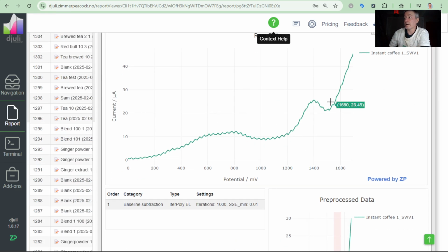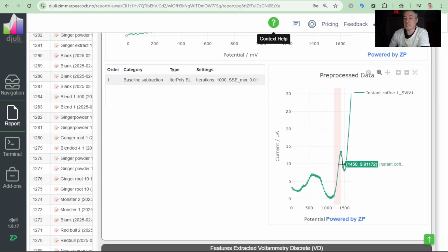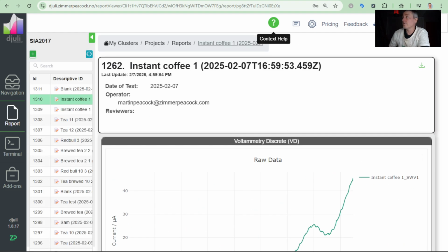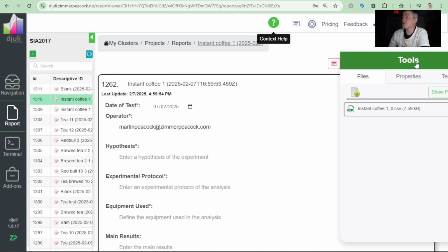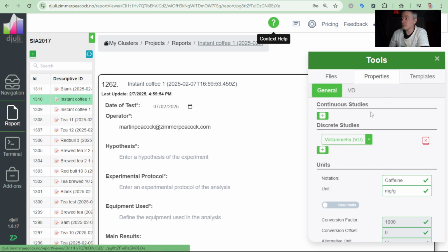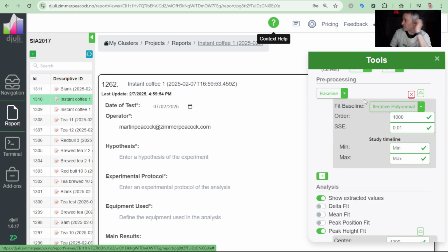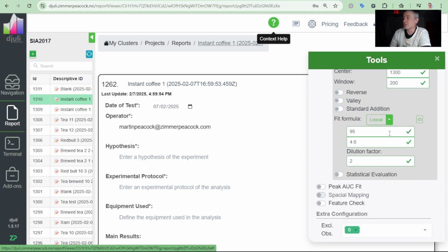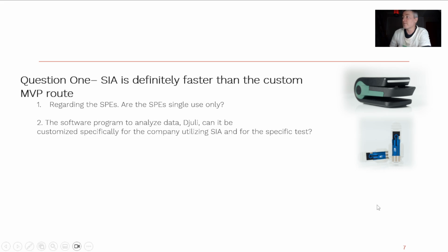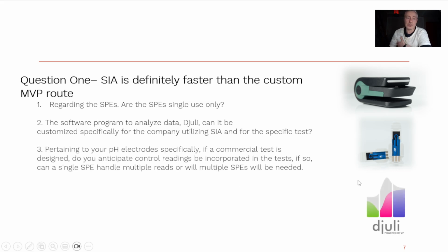It sends the data to the cloud. We can process data in the cloud, and we can turn peak height into concentration. All of this is completely open to you, but there is a catch. You do need to sense it on the platform, and you do need the technology. There's very little point in asking questions; there's a good point in actually getting on the platform and using it. So the quick answer is it's very flexible. You don't even need us involved. I will do a little demonstration on that.